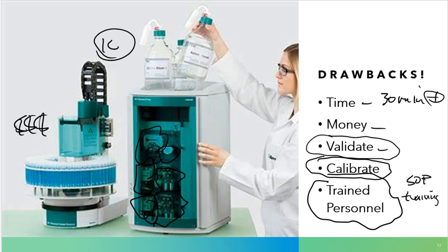So there's a whole process about onboarding and training that a laboratory has to go through to make sure that you really do know how to use some of the instrumentation that you're using in the identification test. That necessarily doesn't really happen on the reagent side of the house. There is way more training that has to be performed on the instrumentation side versus on the chemical reagent side of add a few drops and tell me what you see.